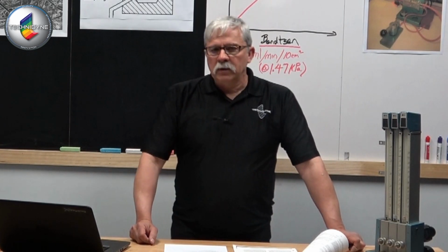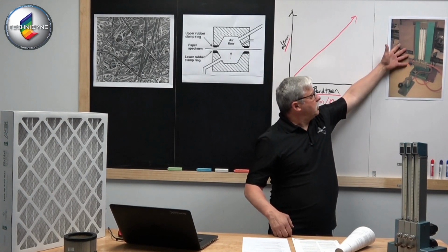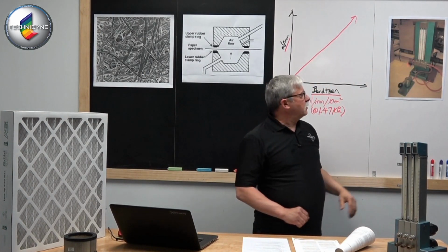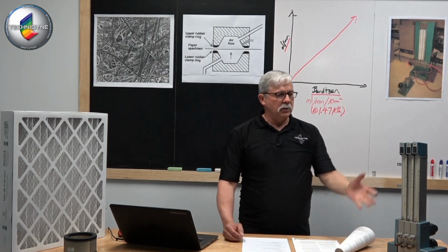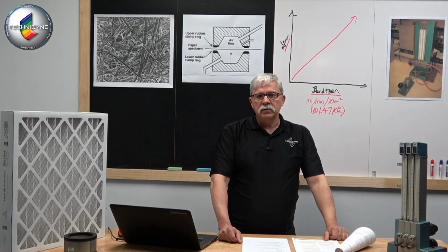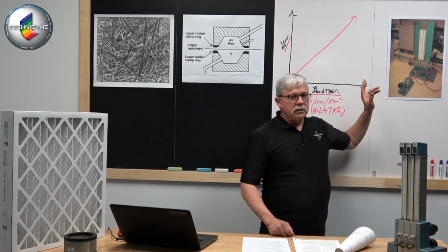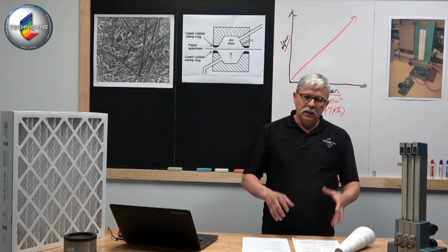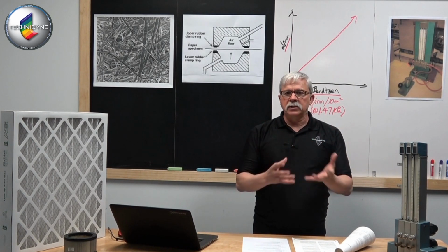I do apologize, I don't have an instrument necessarily to show you, but to give you an idea, this is one of the original setups that Bendtsen had created. He utilized flow meters similar to the Sheffield. They were rotameter flow meters to measure the milliliters per minute flowing through the sample. As I discussed in the earlier video, we need a couple of things to accomplish this test measurement.